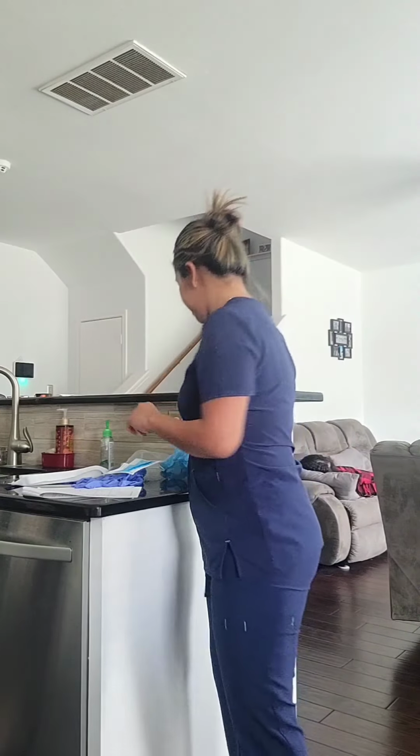Today I'm going to perform skill number 10, which is garbing for sterile hazardous compounding. So I have entered the anteroom and I remove all my jewelry and my nails are neat and clean. Alright, and now I'm going to put the shoe covers on.